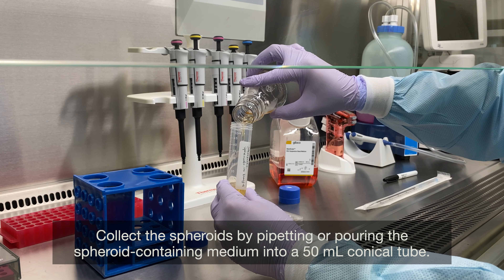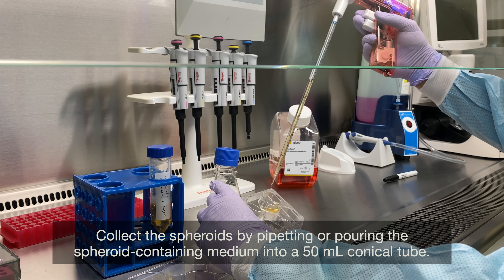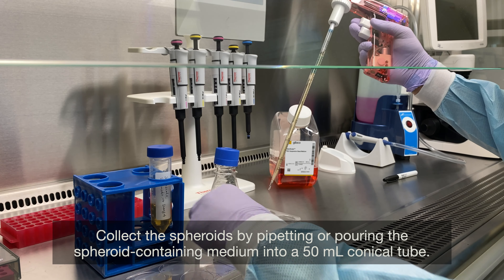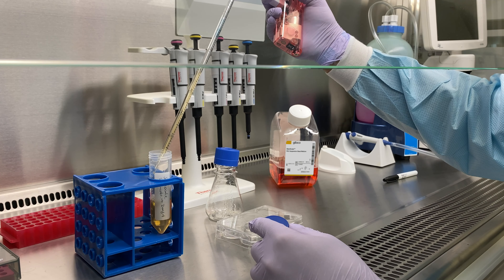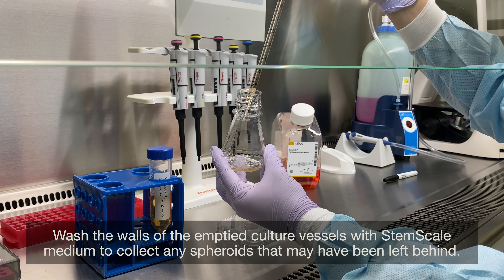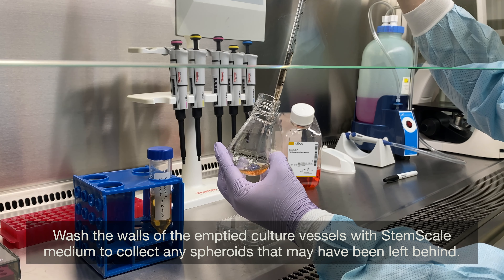Collect the spheroids by pipetting or pouring the spheroid-containing medium into a 50-milliliter conical tube. Wash the walls of the emptied culture vessels with StemScale medium to collect any spheroids that may have been left behind.